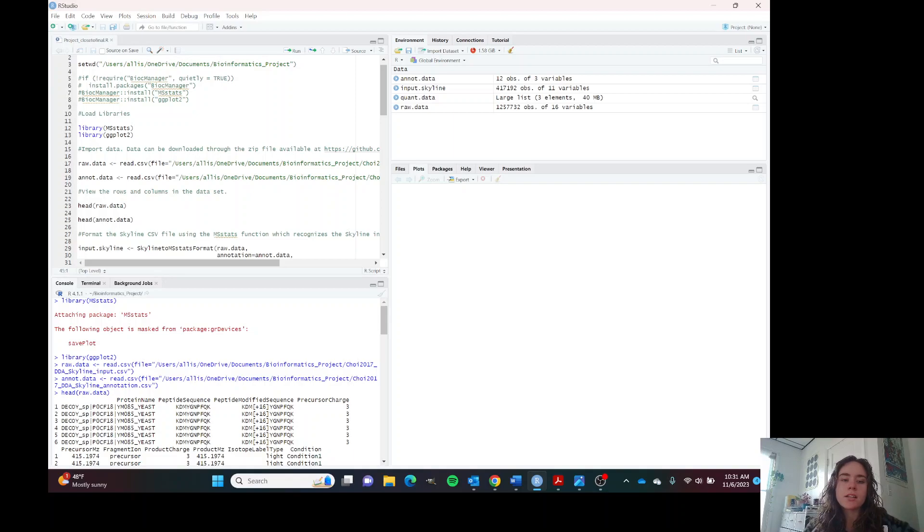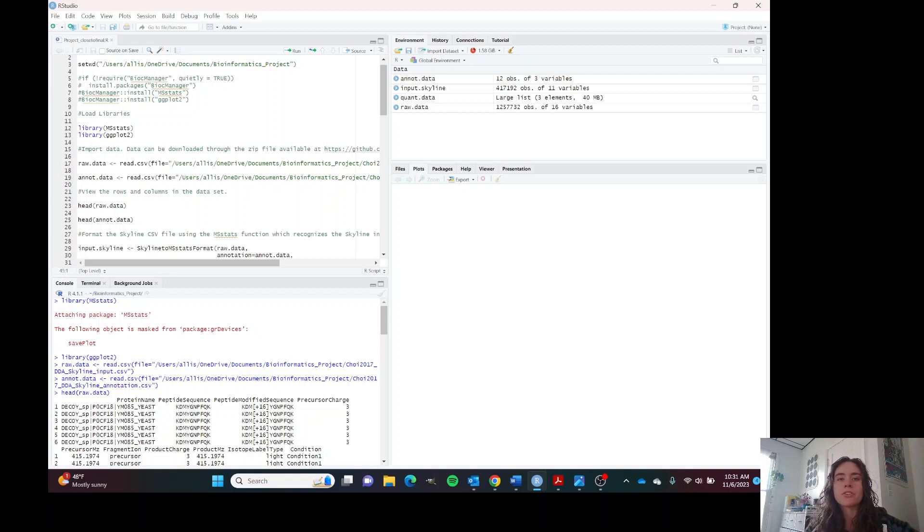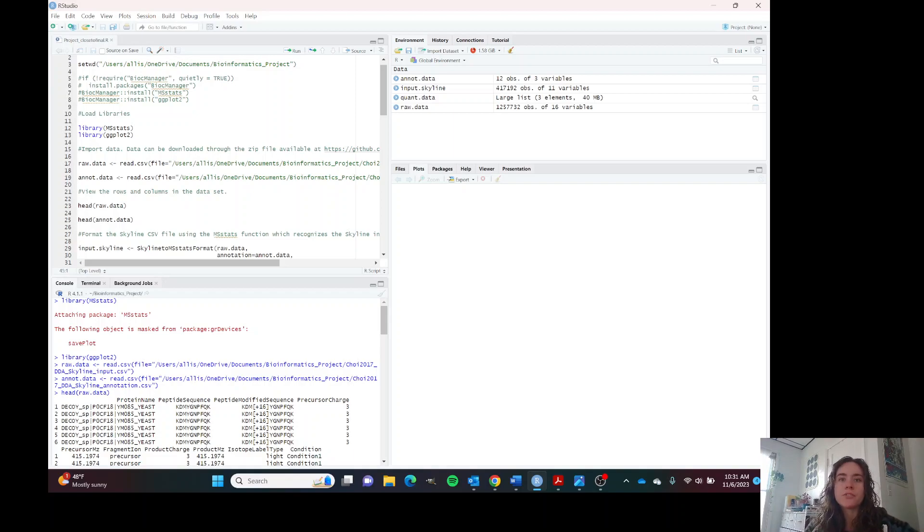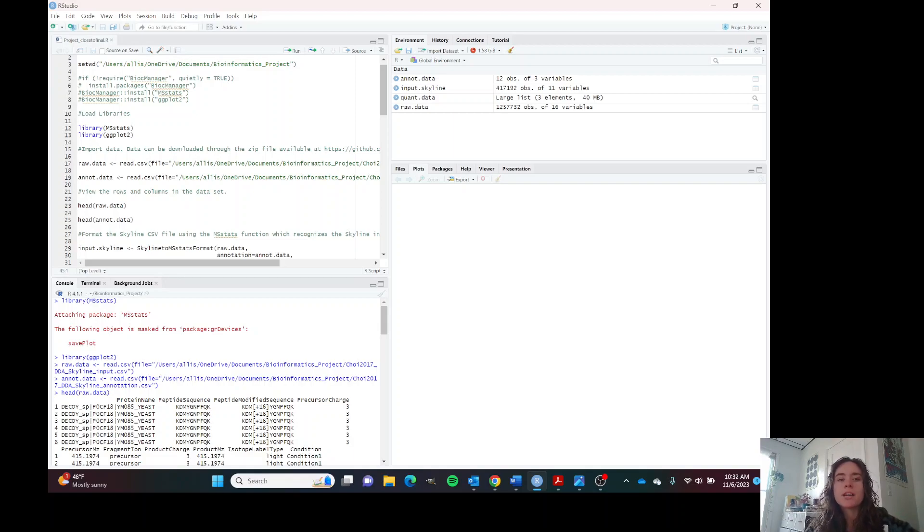Skyline also calculates the peak area of the chromatogram, which is created by the mass spectrometer, for each of these ions or peptides. And the peak area is how we measure the intensity or the quantity of the protein in the sample.